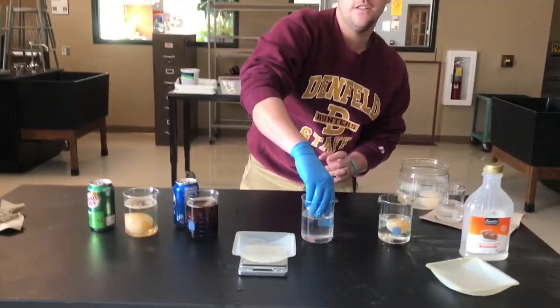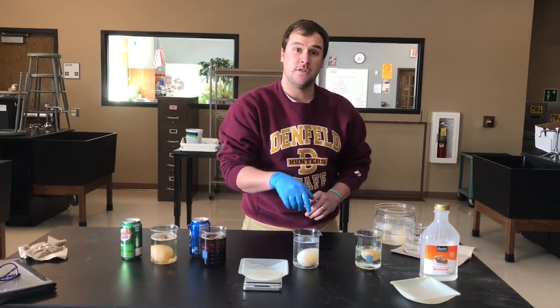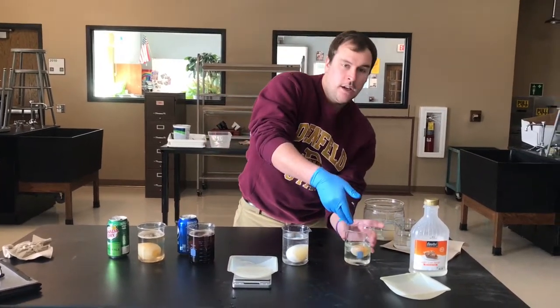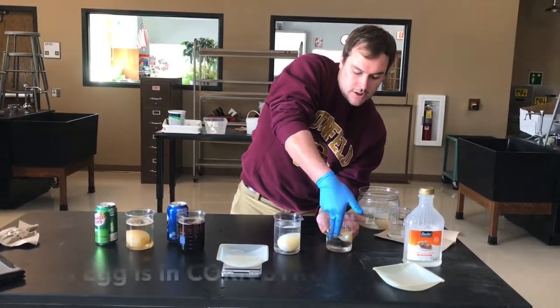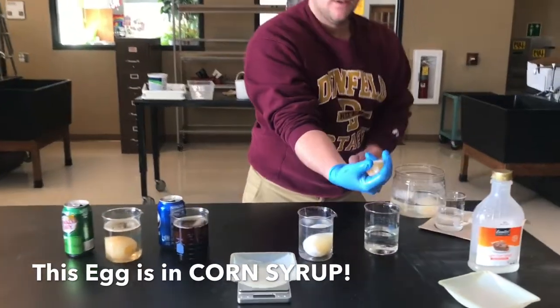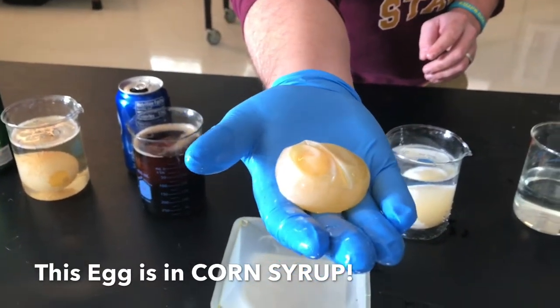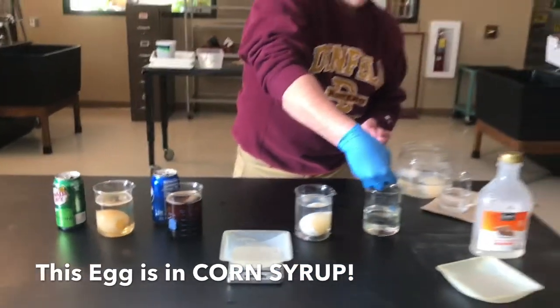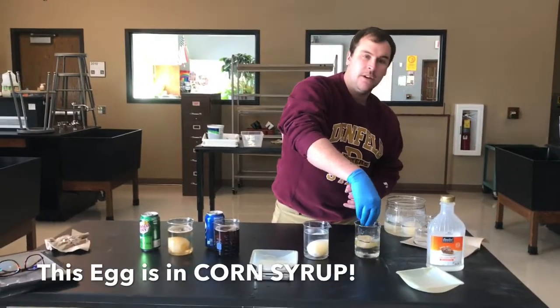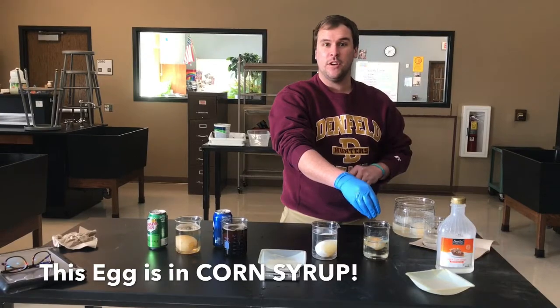So I will measure that, and you will get the mass of that egg, and we'll compare it to yesterday's original mass. Here's another cool one in the cornstarch. And I have to be very careful with this guy. All right, there is our egg in our cornstarch. Again, you are going to describe what happened by comparing the masses of the before and the after.